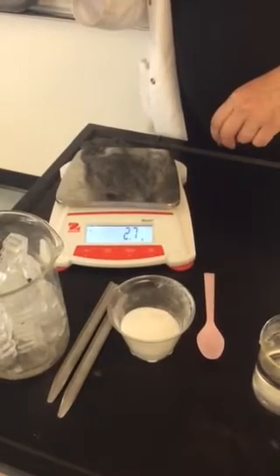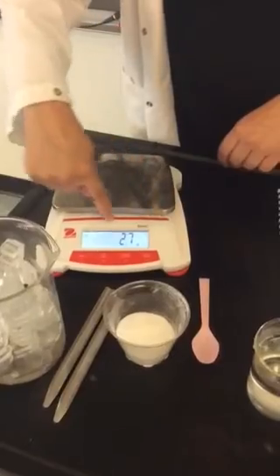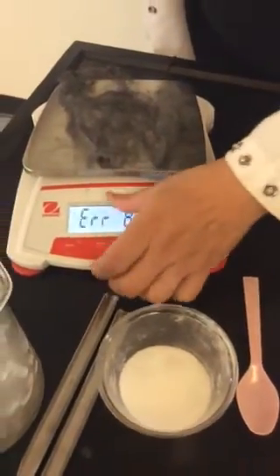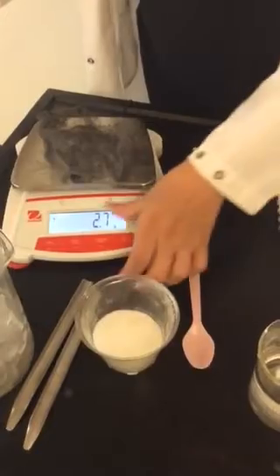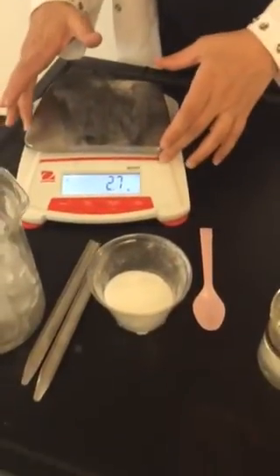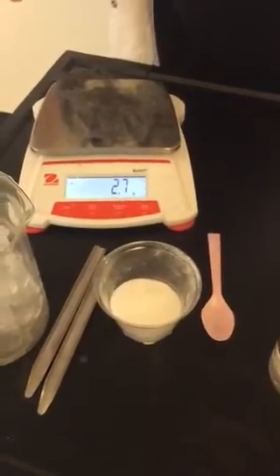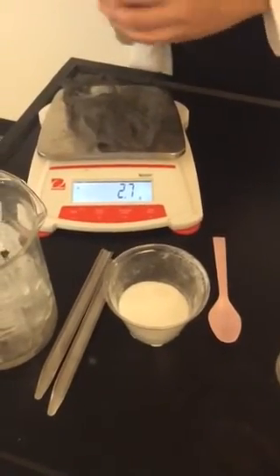Now, this is a perfect example of human error. I lost quite a few pieces of steel wool when I was pulling it apart. You can kind of see them all as I sweep them together here that have fallen off the scale. And I think that they, if I could have gotten them all back together, would account for that 0.1 gram. Ideally, we would not have found a mass change from the same exact piece of material in 2 different shapes.